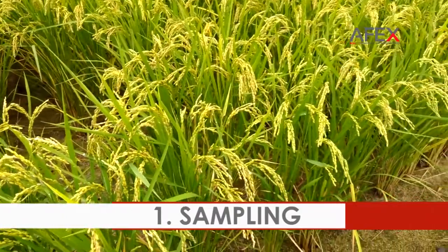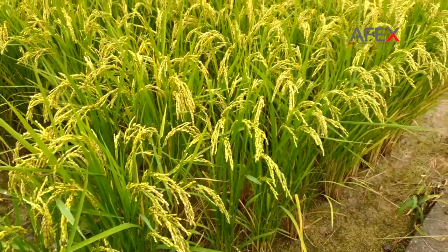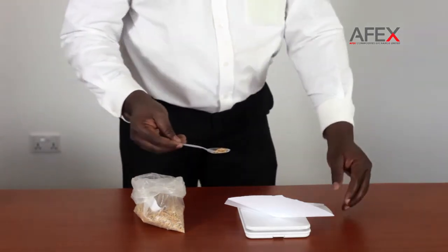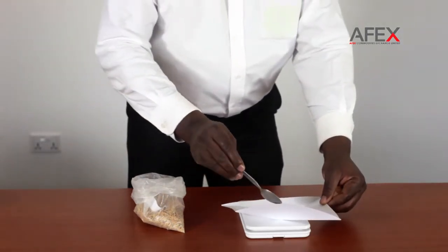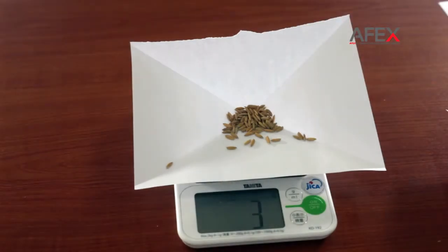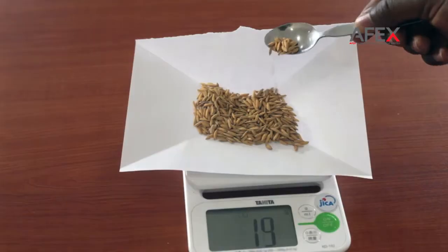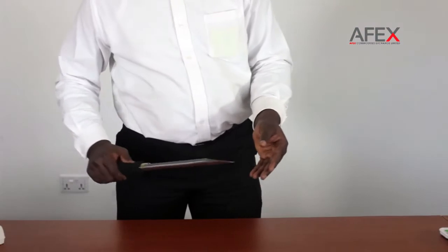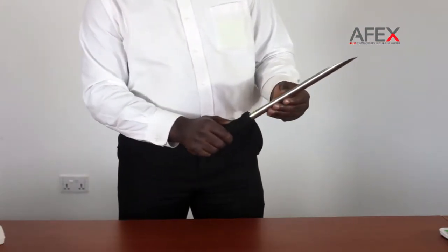Sampling. Take a random sample of paddy from the lot whose quality you wish to check. Measure 3 grams for moisture content check and 20 grams for other type checks. Use the spear to take a sample from the bag.